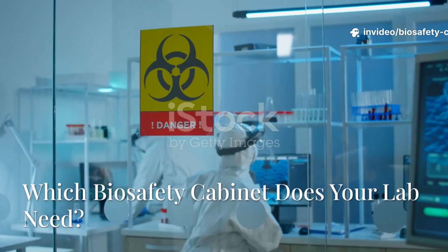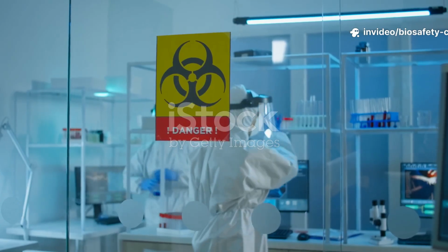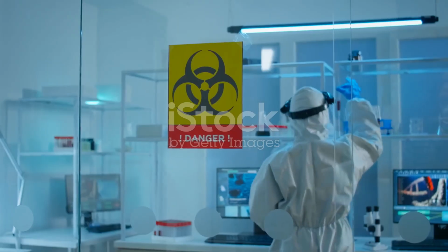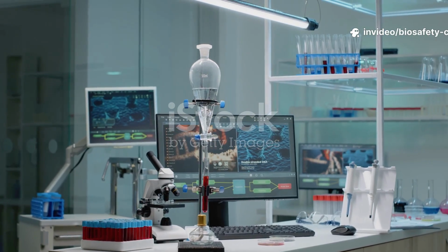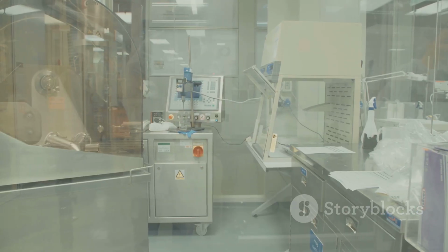Alright, let's break down something every lab professional needs to know: biosafety cabinets, or BSCs. These are your frontline defense against biological hazards, and understanding their technical details is key to lab safety. Ever wonder why there are different classes? Each class and subclass has unique airflow patterns, filter setups, and protection levels. Let's clear that up so you never get caught guessing which cabinet to use.